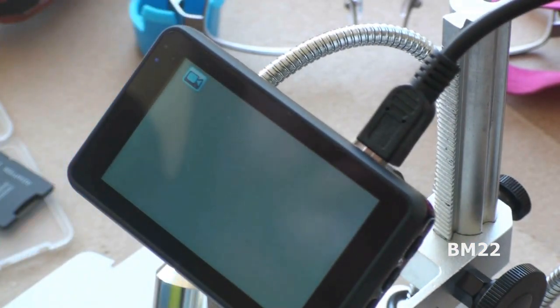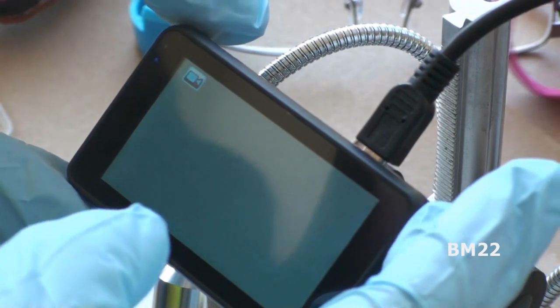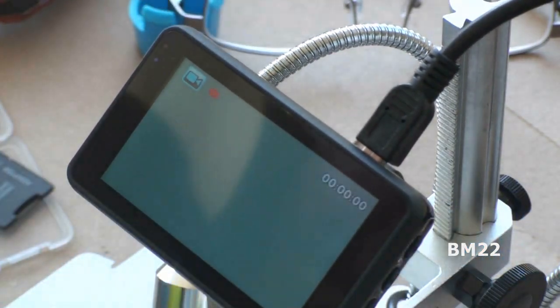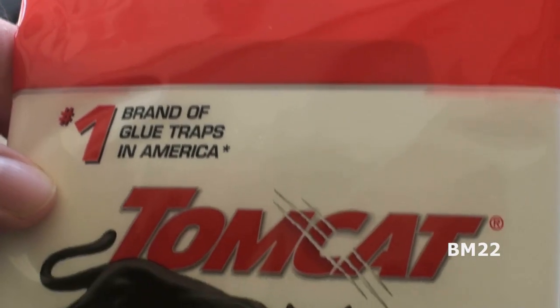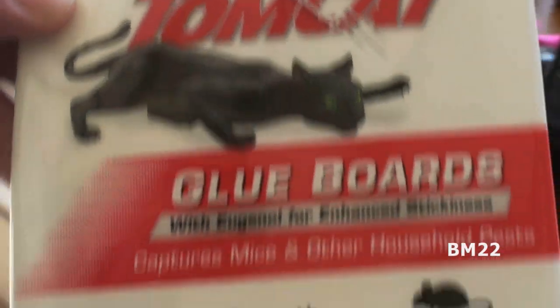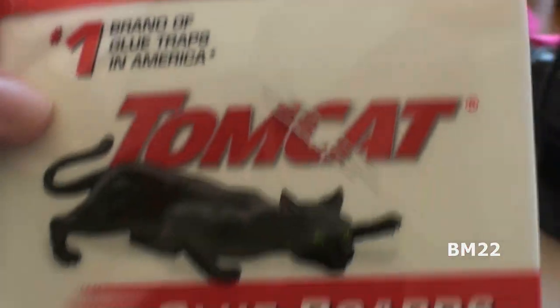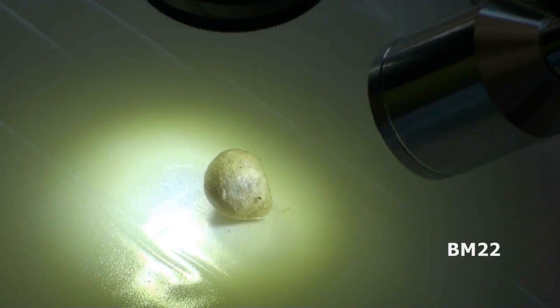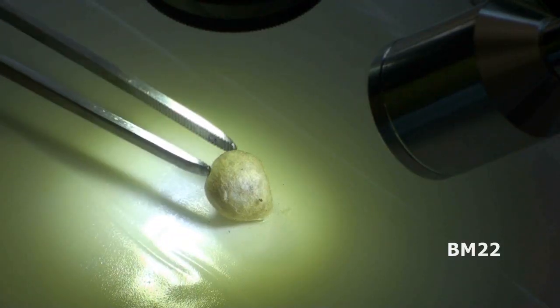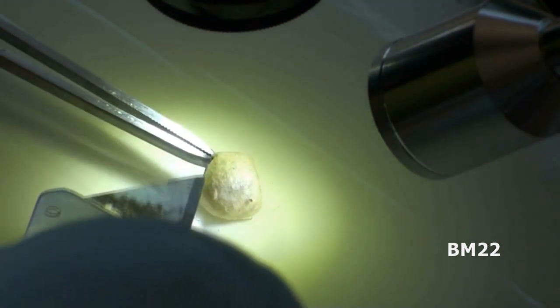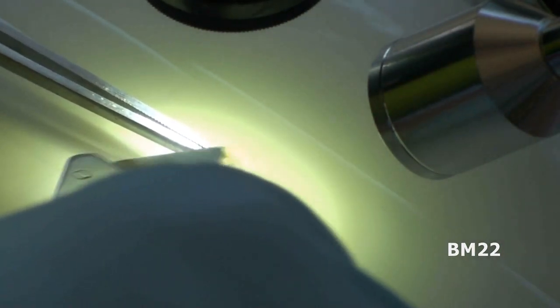And one other quick thing. If you remember the last time we opened an egg case, spider babies came pouring out and we had to torch them. This time we're going to open the egg cases on one of those glue boards, one of those mouse catching glue boards. This glue board is from Tomcat. So we put the glue board under the microscope, we put the egg case on the glue board and here we go.